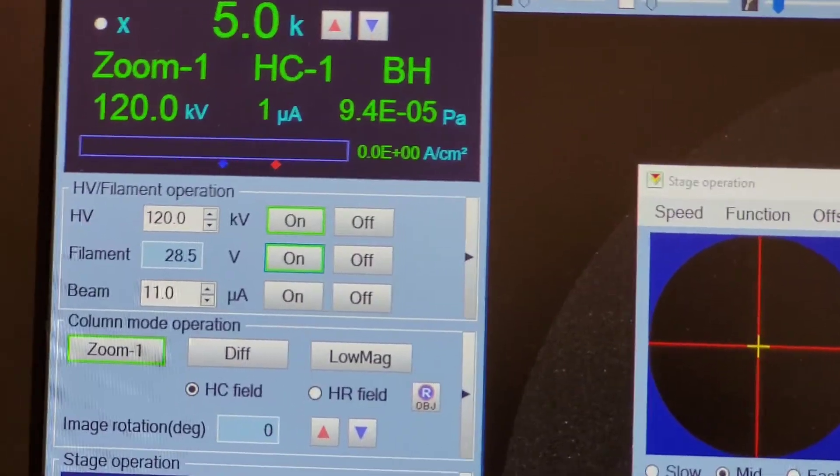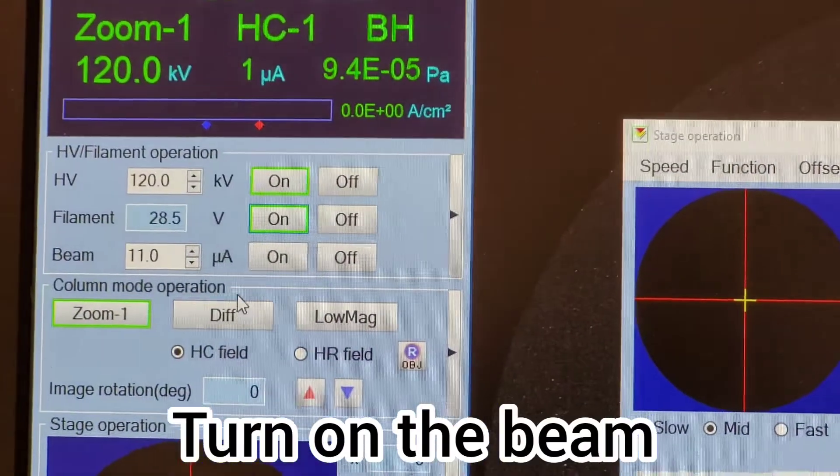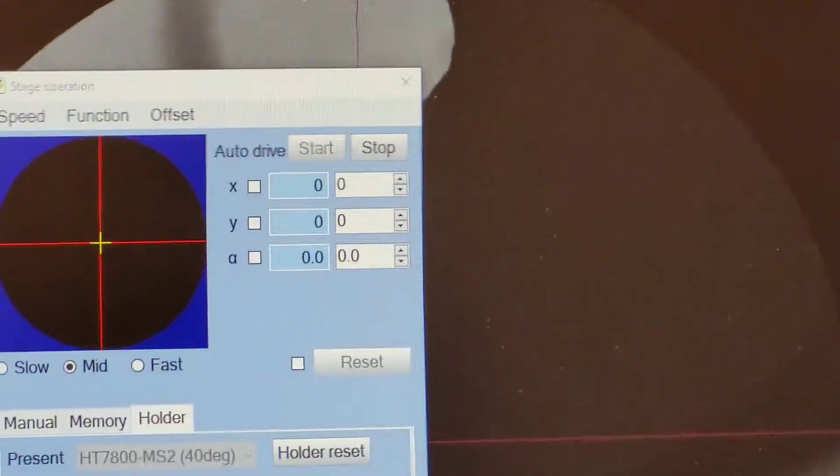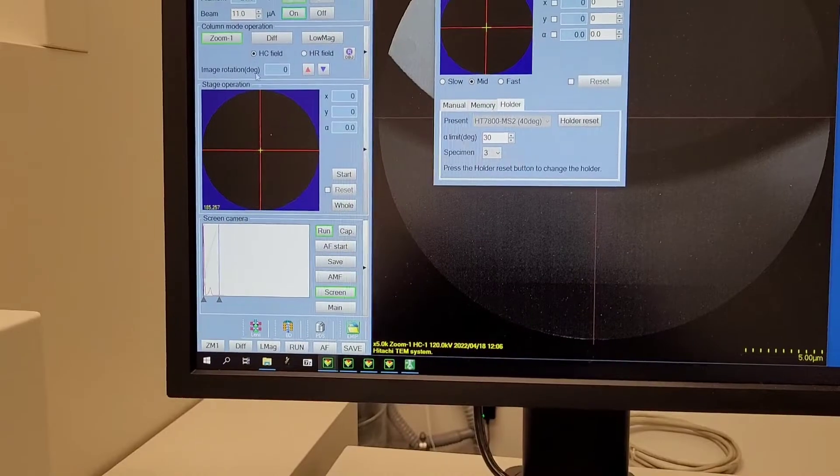Now that the pressure has dropped, you can finally turn on the beam and then you'll be able to finally take cool images.